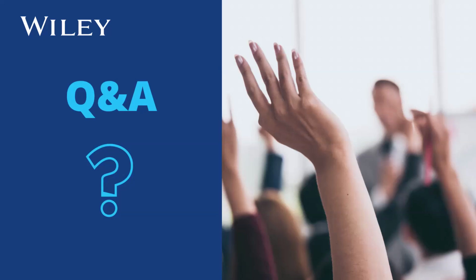Here's always a very good question that we like to answer. So where can I get more information on supported instrumentation? Okay, we have a marketing website, and one of the links is supported formats. There you can find out which different technologies we support. Each technology has a different vendor format, quite a lot. So that's the available formats. Yeah, and the URL is sciencesolutions.wiley.com. There you can access all that information. Great, thank you both.